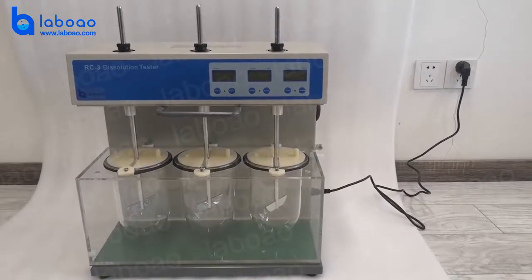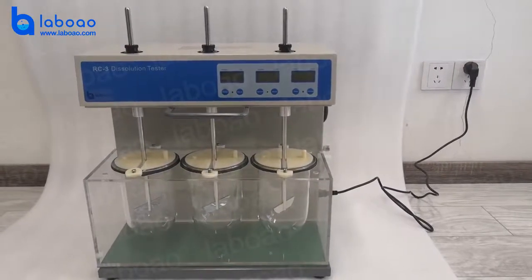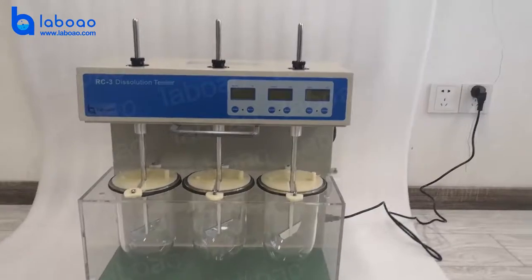Hello, everybody. Welcome to LIBOR, our company. Today, I will introduce our RC3 dissolution tester. Okay, let's start.